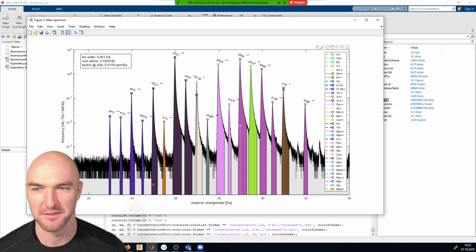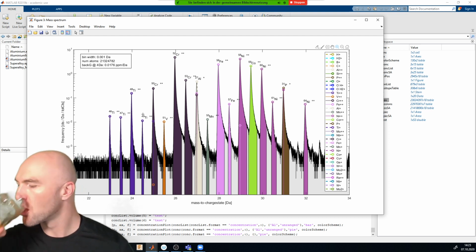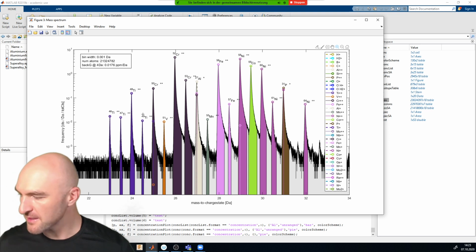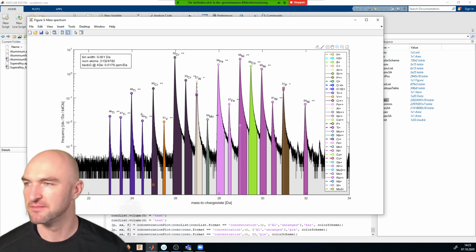Yeah, I would say that it's in the software package ePOSA, which is developed by Jens in Aachen, and I'm going to talk a bit about overlap solving in the next class. So stay tuned for that. I'm not going to talk about proximity histograms. Yeah, that's fine.